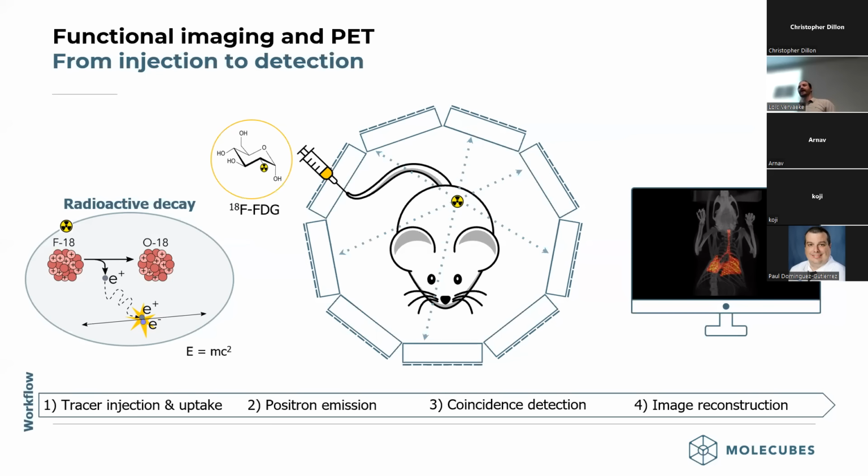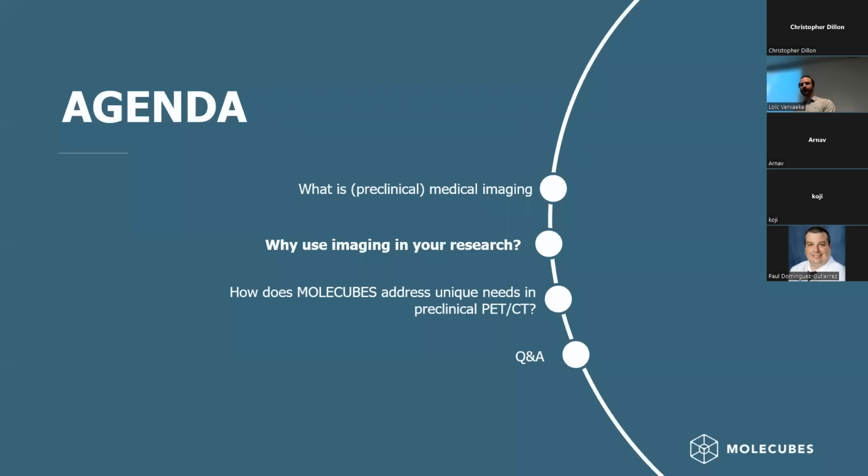occurred. And by having billions and billions of these coincidences, you get a whole PET image at basically a very high resolution and a very high sensitivity. So even within the complete interior of your animal, you would be able to capture these coincidences. So this was just roughly broadly on PET imaging in a preclinical setting, what it exactly is.